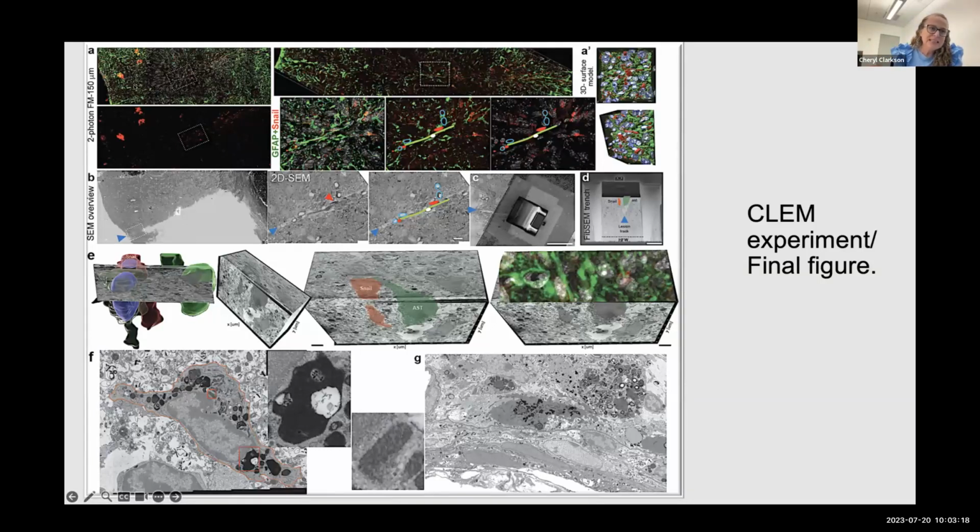So as you can see here, in A, I have the entire steps that I already showed to all of you that we did for the light microscopy in the 2-photon and my surface model. And after that in B, I start the ultrathin sectioning. And you can see here, with this little blue arrow, as soon as I start to see the lesion track that is going to start here, I stop it. Because at that moment, I need to go and see if I have my region of interest.